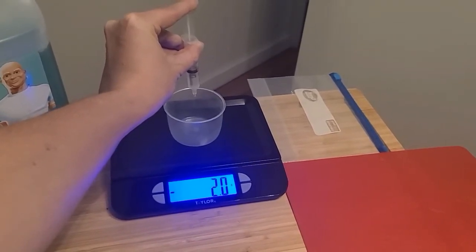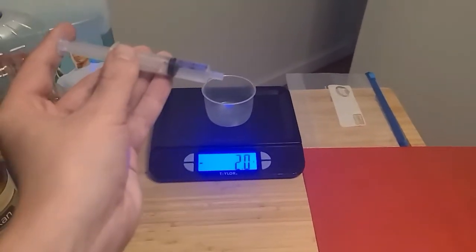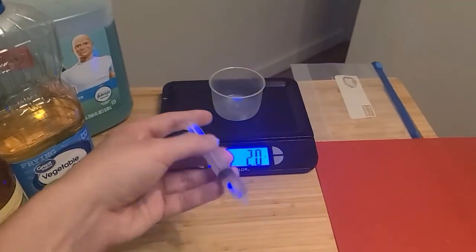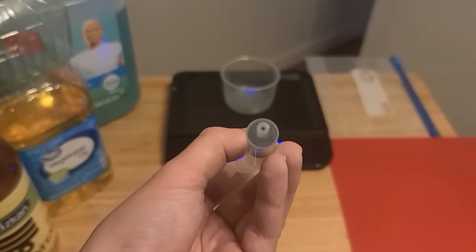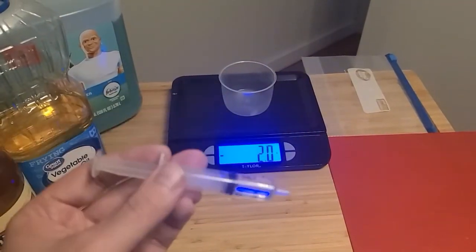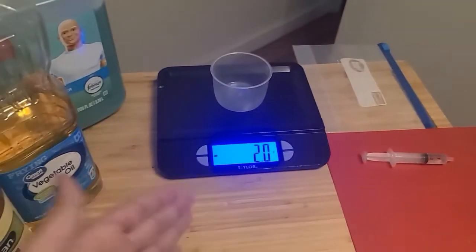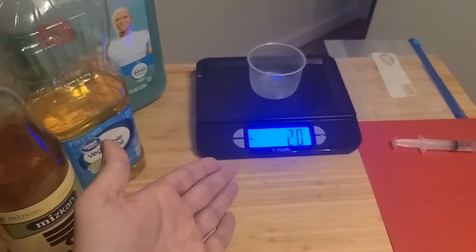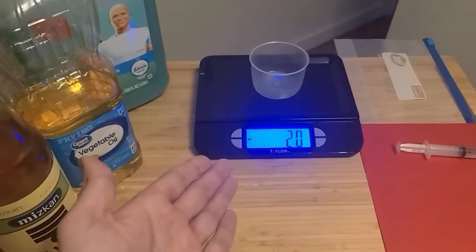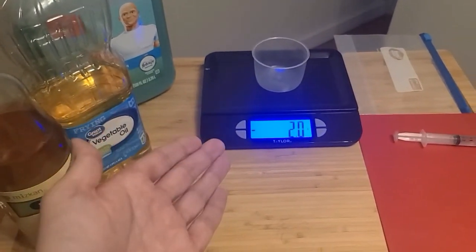The idea is that after a certain number of drops, I get the mass from it, and then I have the radius from the tip, and I can use that to determine the surface tension of my different liquids. Since my balance isn't the greatest, I'm doing it 3 times for every single liquid in hopes that I eliminate some of the error from the balance not being the most accurate.